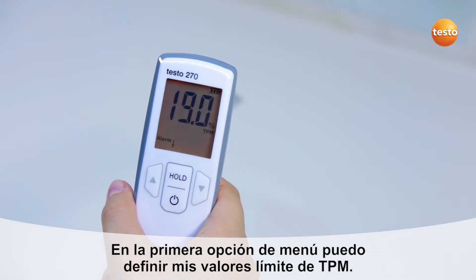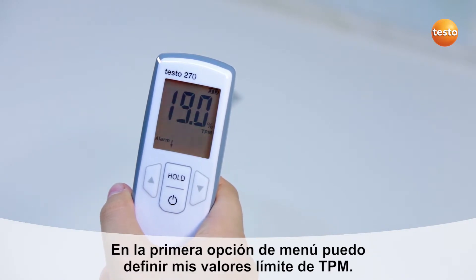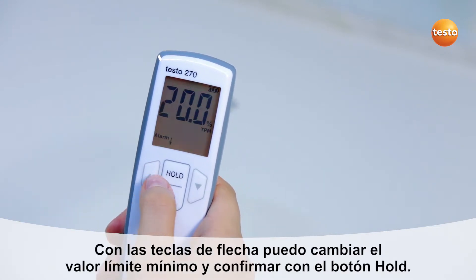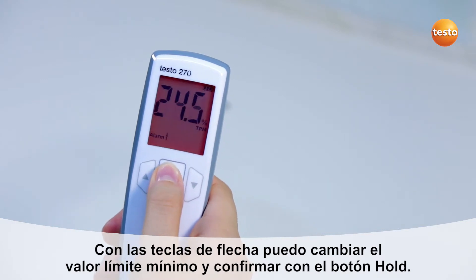In the first menu item, I can define my TPM limit values. With the arrow buttons, I change the lower limit value and confirm with the hold button.